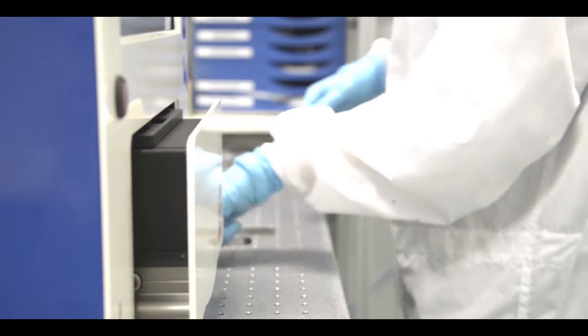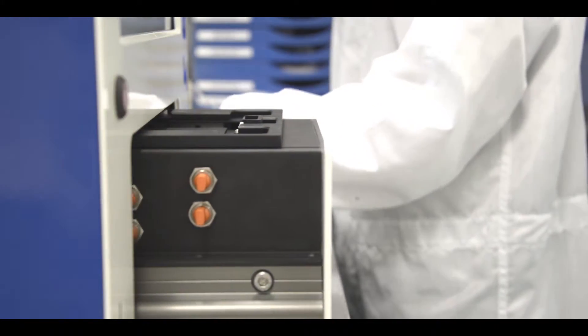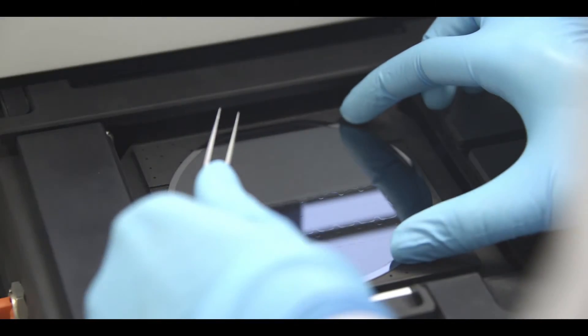Controlled by touchscreen, as with all of the equipment in the UV-Cube range, UV-Cube 3 allows easy, quick and accurate alignment with its two high-resolution cameras controlled by ACSA.